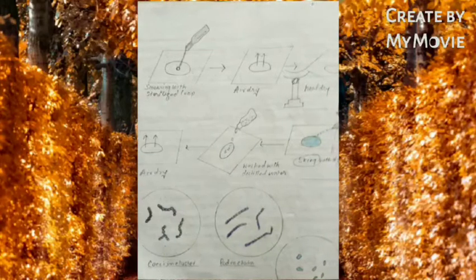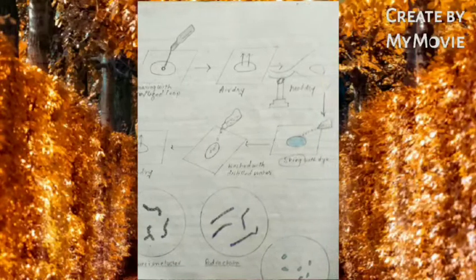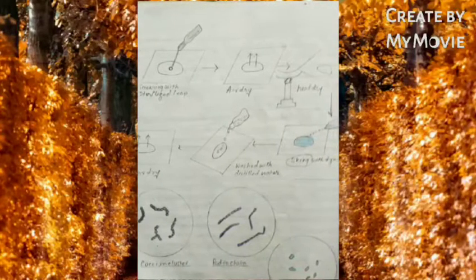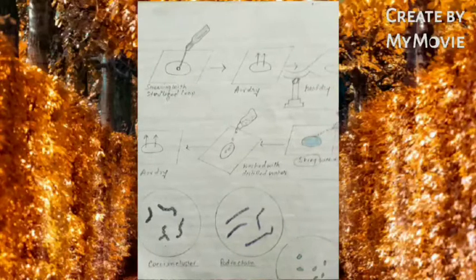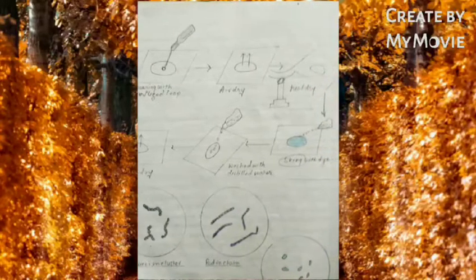The advantages of staining are that the cellular arrangement and cells are more clearly visible, whether these are rod, cocci, or spiral in shape. Differences between cells of different species and within the same species can be demonstrated.